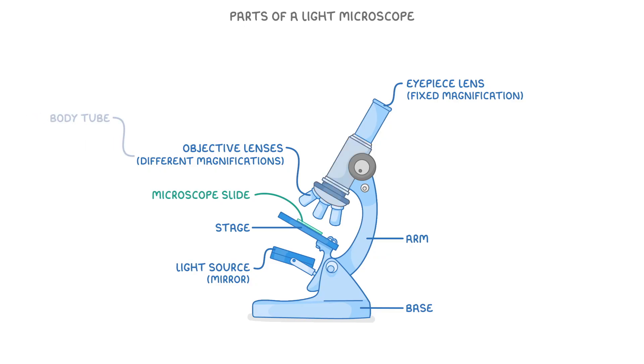Then the last things to notice are the body tube here and the coarse and fine focusing knobs, which we can turn to help us get the image in focus.